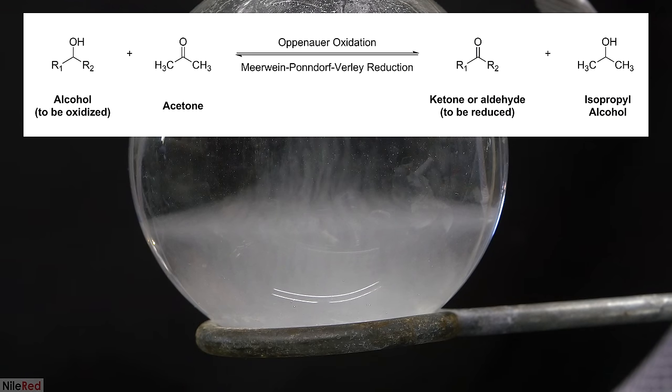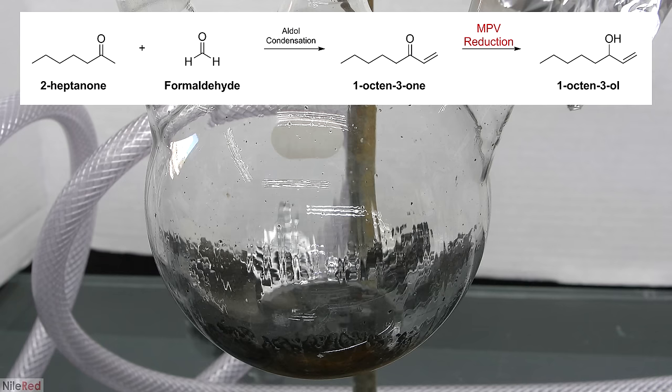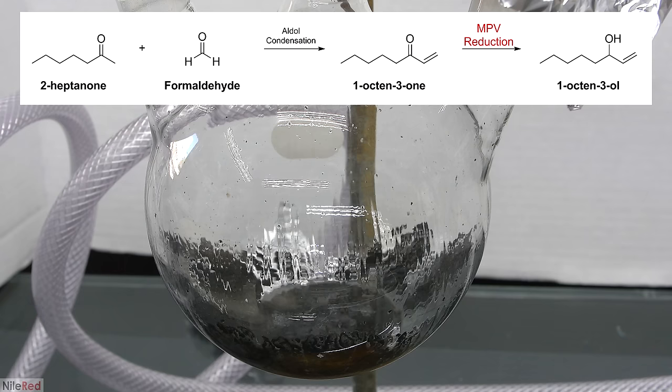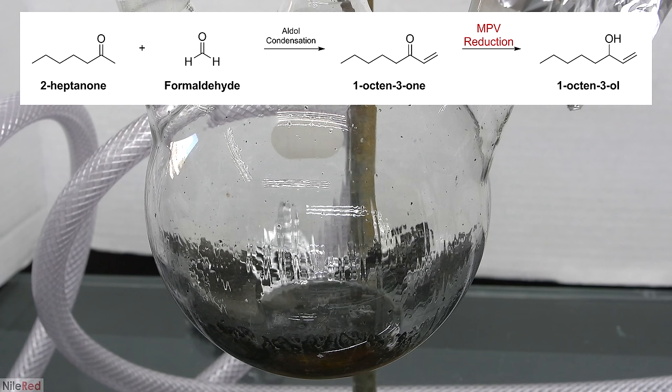The direction of the reaction depends on the starting material. I plan to use it in an MPV reduction to make 1-octen-3-ol, which is a chemical attractant for biting insects. I've shown the overall pathway, and highlighted in red where the aluminum isopropoxide comes into play.